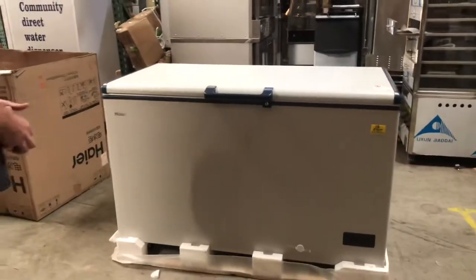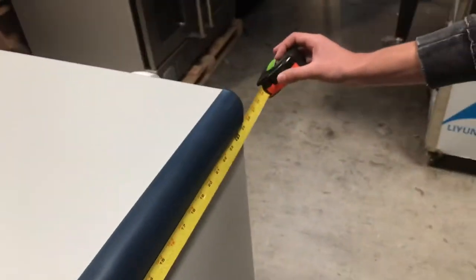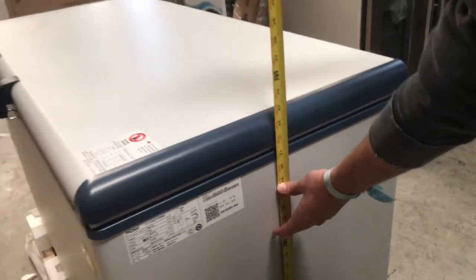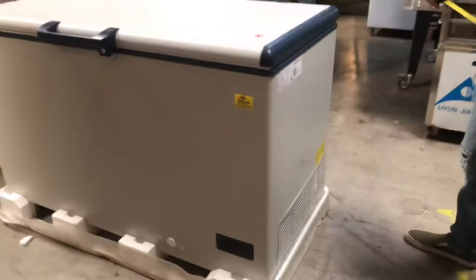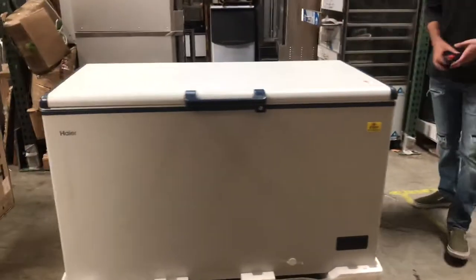You can take a look at the sticker right there at the top right corner. Let's go ahead and give you the overall dimensions of this unit so you have an idea. For the length, you're going to be looking at a total of about 55 inches. The depth, you're looking at about 25 and a half inches. This unit is going to stand at about 35 inches high. The unit does come with wheels so you can easily move it around.